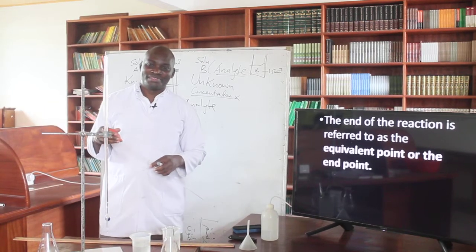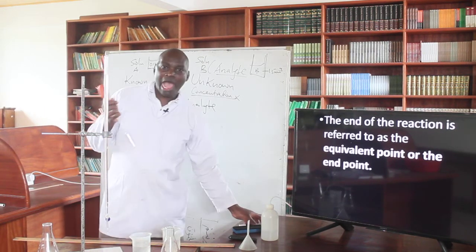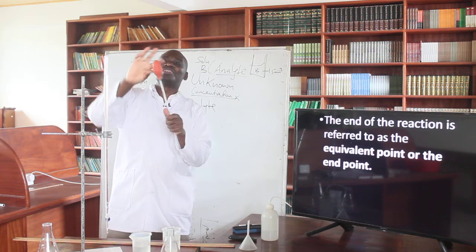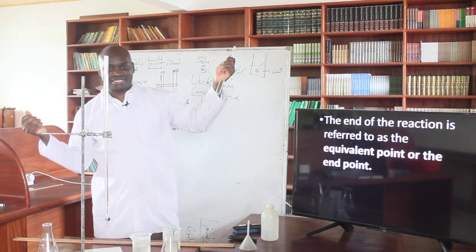Yes, so picking from where we left, I wanted to show you this one, which is called a pipette. And this one is a pipette filler. So, a pipette filler and a pipette.